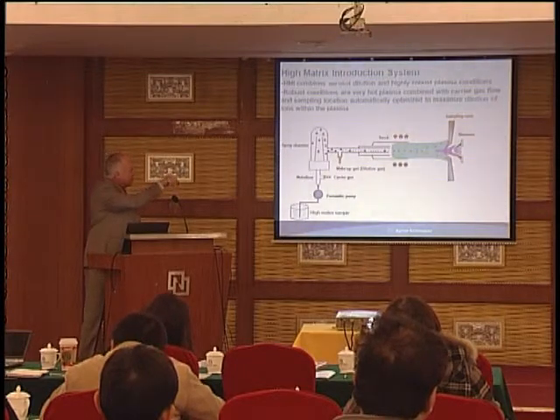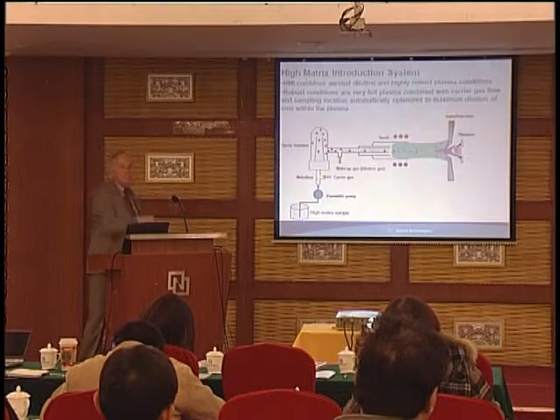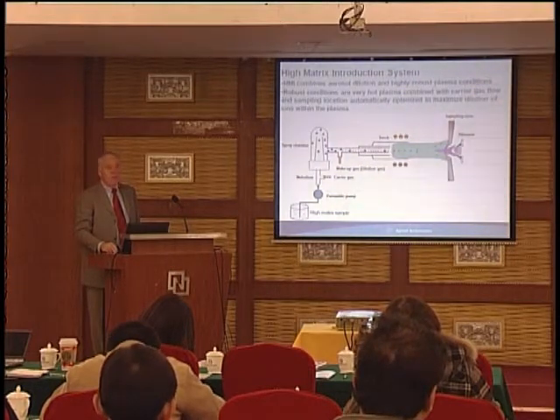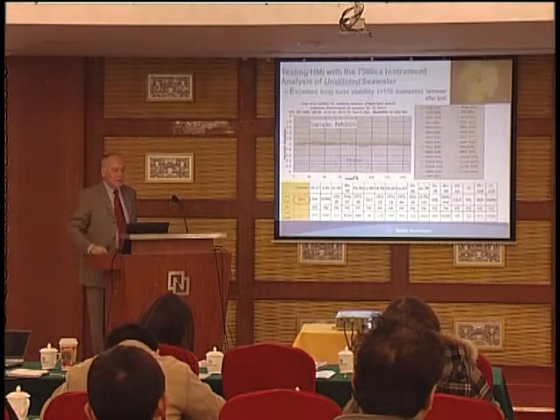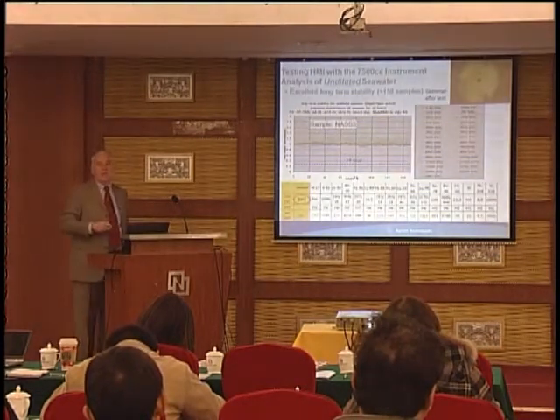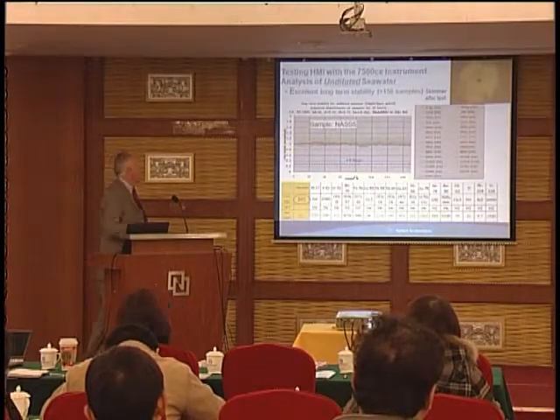That allows some distribution or some spreading out of the ions, again, to reduce the concentration of the material that gets into the ICP-MS. And our goal was to be able to measure high concentration samples, high TDS samples, for example, like undiluted seawater, which is about 3% dissolved solids.